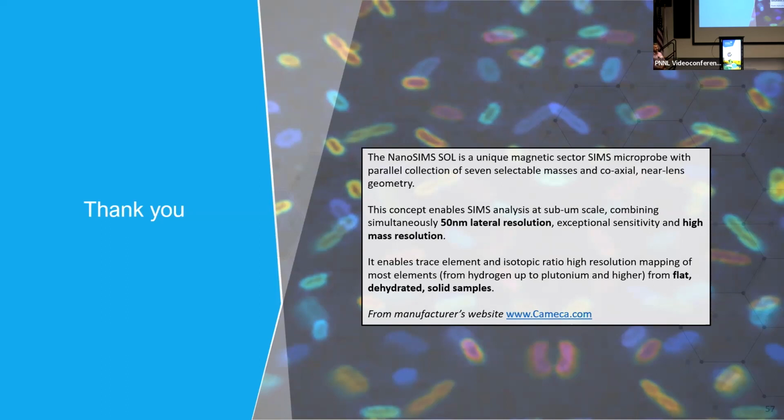Yeah, that's right. Interferences are one of our problems. We just have to think it through, make sure we know what the potential interferences are, and work with that, because we do see it from time to time. But there are quite a few rare earths. Right, I was thinking about natural samples, instead of using concentrated ones to label. Right.